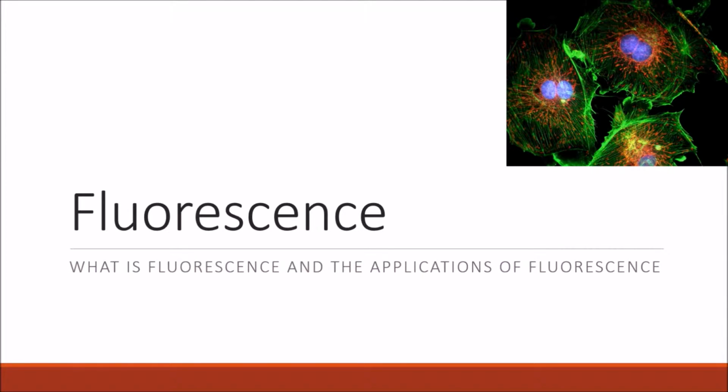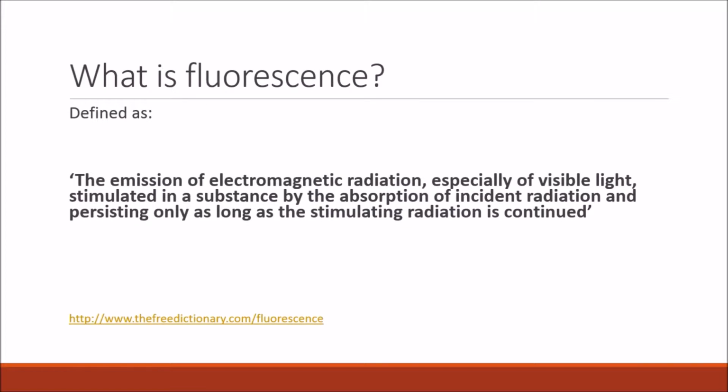But before I even start talking about fluorescence microscopy, we're going to talk a little bit about fluorescence. And in this short introduction, we're going to talk about what is fluorescence and what are some of the applications of fluorescence. So first of all, what is fluorescence?